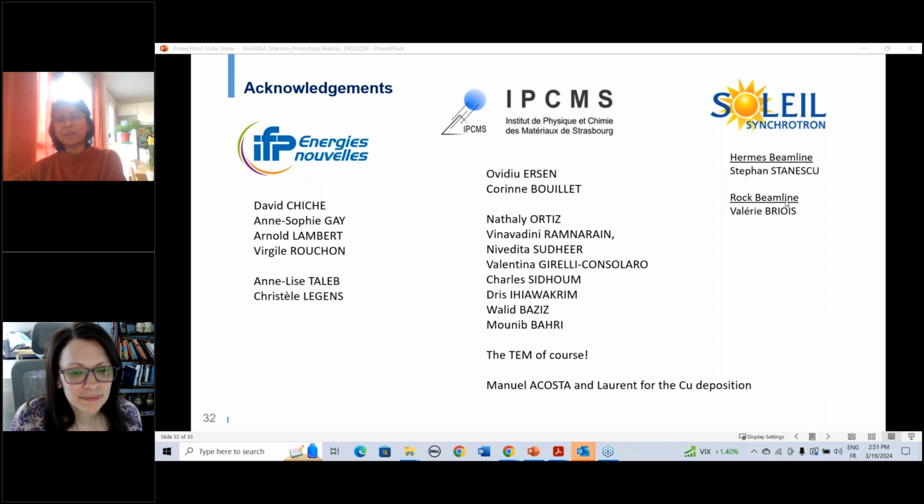In this particular case, we didn't really analyze the residual gas, because we're not really concerned about the activity. We expect to consume everything, and we don't really care, because it's not a specific product that we're looking for.